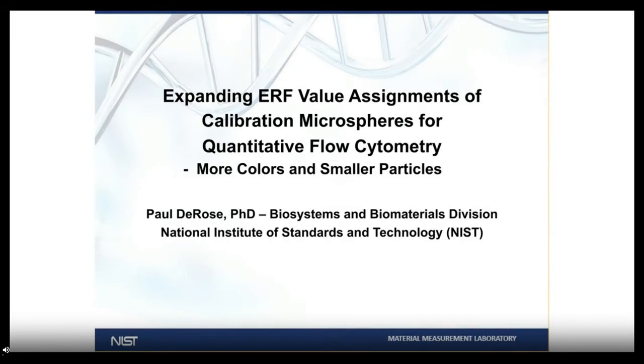Hi, I'm Paul Derose, and I'd like to thank Thermo Fisher for inviting me to speak. Today I'll be talking about NIST assignments of ERF fluorescence intensity values of calibration microspheres for quantitative flow cytometry. And more recently, we're expanding these assignments to more colors and smaller particles.